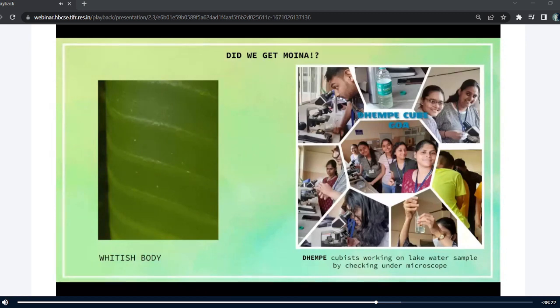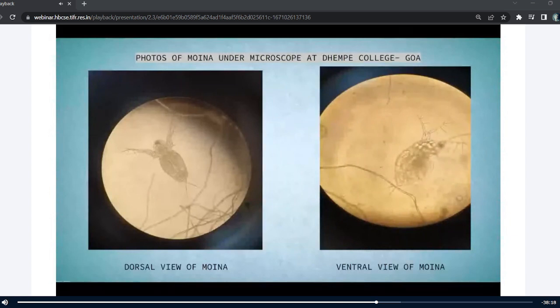So did we get Moina? Yes, we got Moina! Here you can see two pictures — one showing the dorsal view of Moina and another showing the ventral view. In the dorsal view, you can see the eyes, the appendages, the antennas, the apical spines, and the body. Both pictures look so different even though they are of the same organism. At first, even me, my friends, and the teacher were confused about how the slide looked so different. But after reading some papers and checking on Google, we concluded that yes, it is Moina, and the same organism has a dorsal view and a ventral view. This is how we found the Moina in the lake water sample. Thank you.